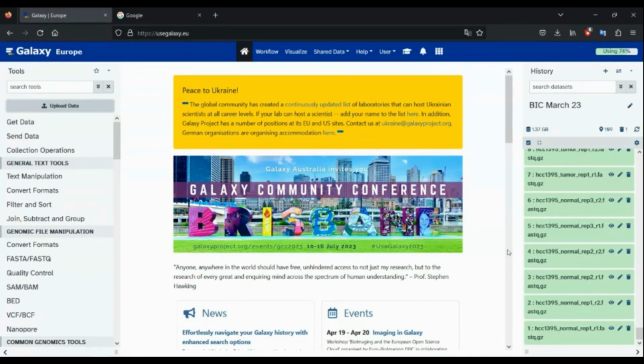So Illumina, as you remember, is a second generation sequencing platform, and it's used for generating short reads. So that's what they have done here. And the test data that we have has been pre-filtered to a certain extent, but we'll be doing some slight more tweaking later on. And obviously, you must have seen that the length of the sequence is quite small.